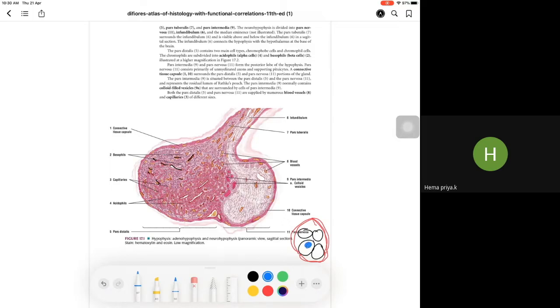They are not plasma cells, but have a plasmacytoid appearance. I am drawing the nucleus just to show the plasmacytoid features. Sometimes they may be situated in the center also. Another characteristic feature is very fine, uniform chromatin distributed throughout the nuclei, a salt and pepper chromatin pattern.